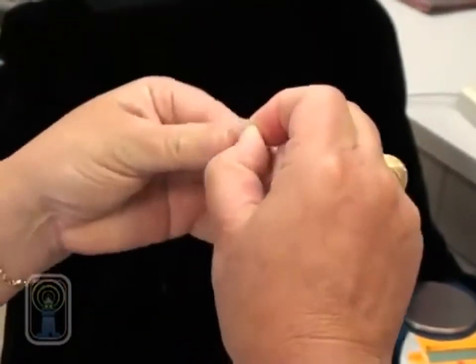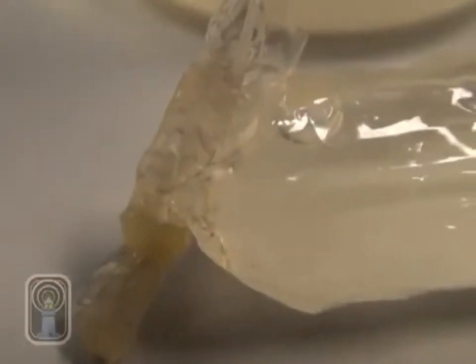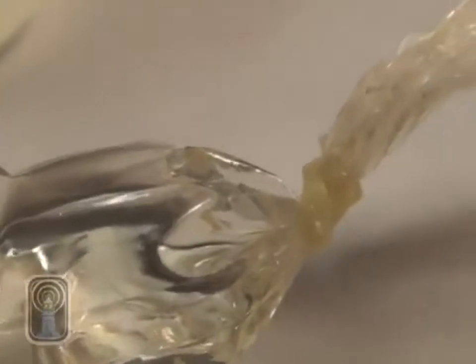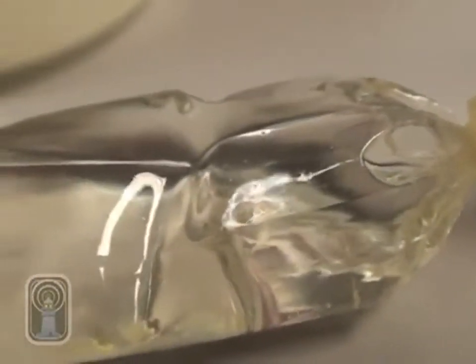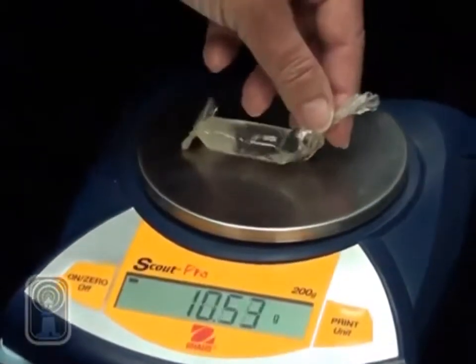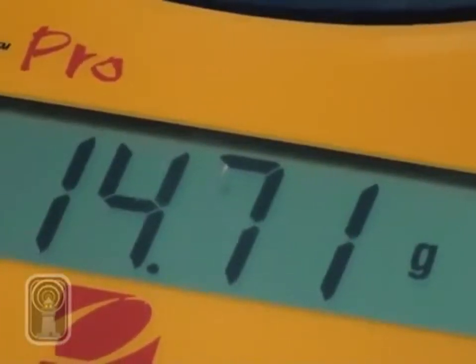The tubing was then filled with a concentrated sugar solution and sugar granules. The second end of the tubing was also twisted, making sure that no air molecules were in the cell. An orthodontic rubber band was used to secure the second end as well. The completed cell was weighed on a digital balance and then was gently placed in a beaker of tap water.